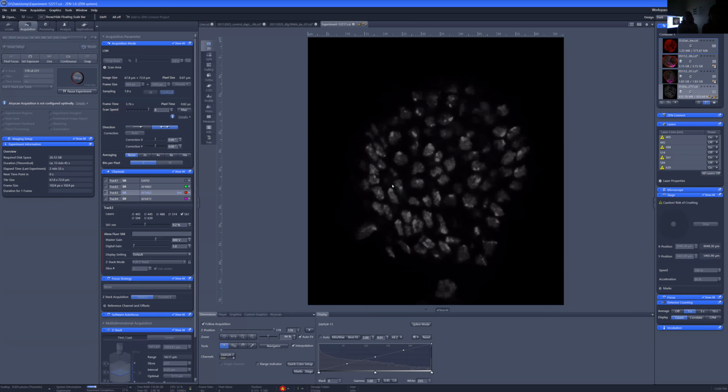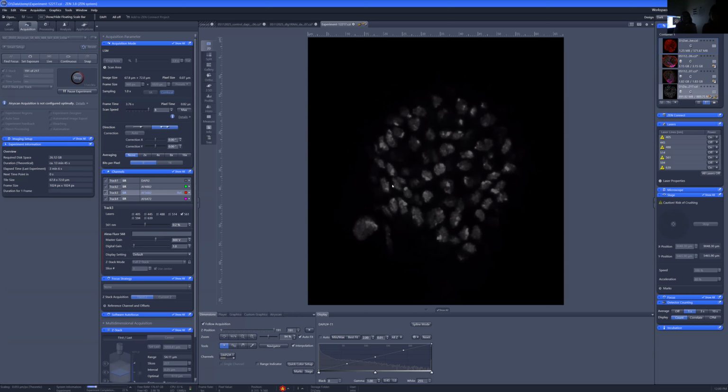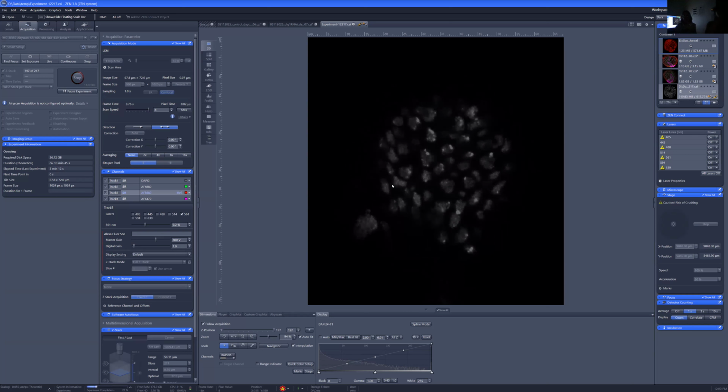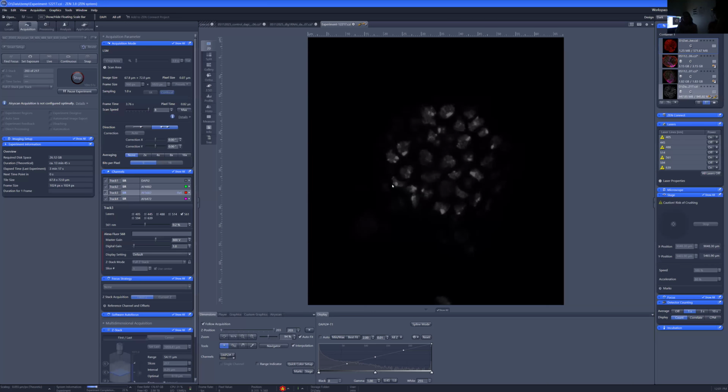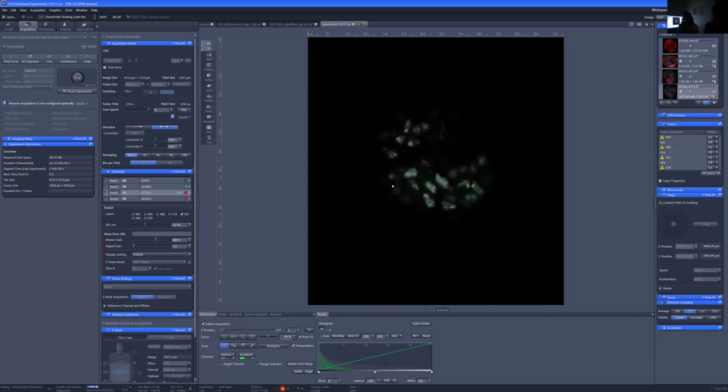And at the end, I'll have all of the information, all 4 colors for every single image. So we're going to start to see, and basically I can tell that we've now passed the midpoint of the ovary, because now the images are getting smaller and smaller as you move to the bottom of the sphere. And pretty soon the microscope's going to make a little noise and start imaging in green. So basically what Jess is talking about for some of the image analysis that I've been doing is that I want to count these numbers of egg stem cells.